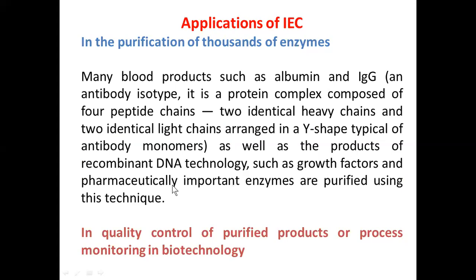So even the products of recombinant DNA fractions can be separated by means of this ion exchange chromatography. And even enzymes can be subjected to separation. Quality control laboratories utilize this ion exchange chromatographic technique for the separation of solutes. And even biotechnology laboratories utilize it for the separation of DNA fragments or even nucleic acids. And like this, many varieties of analytes present in blood samples or urine samples or saliva samples or serum, whatever it is, we can subject to this technique in order to eliminate interferences, followed by the separation of charged species.